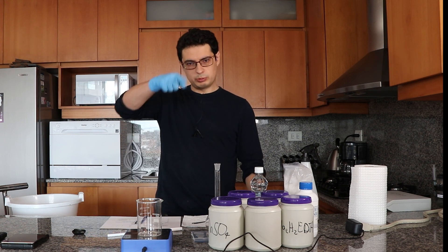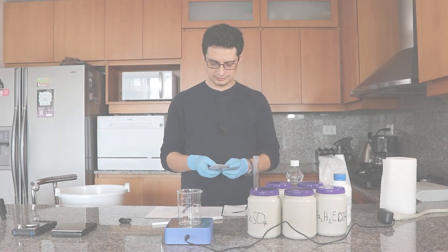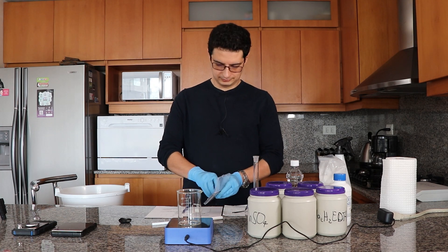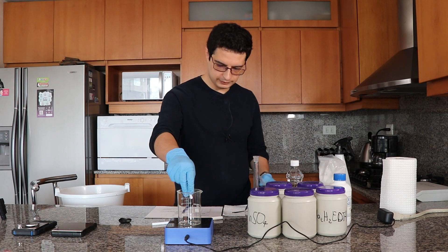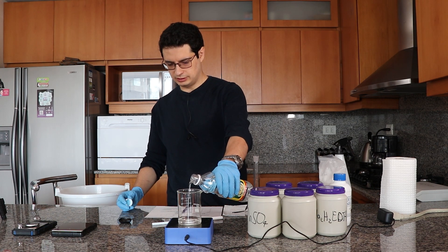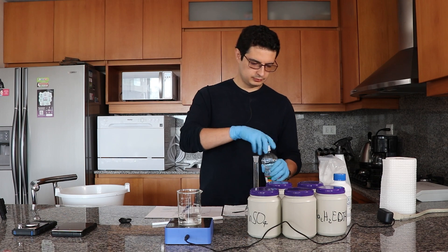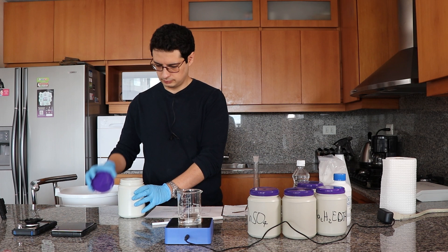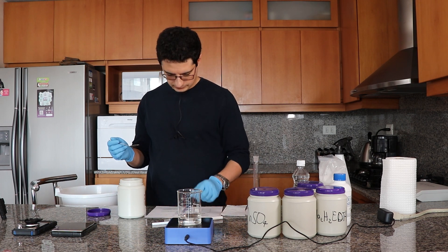Let's prepare it now. The first thing I'm going to do is put a magnetic stirrer inside the beaker, then add approximately 50 milliliters of white vinegar, which is 3.5% acetic acid. This sets the pH from the very start.